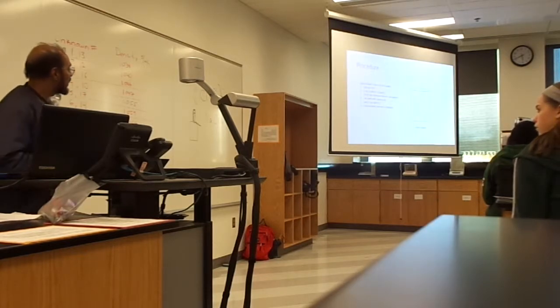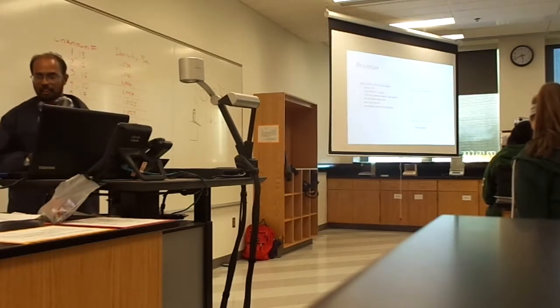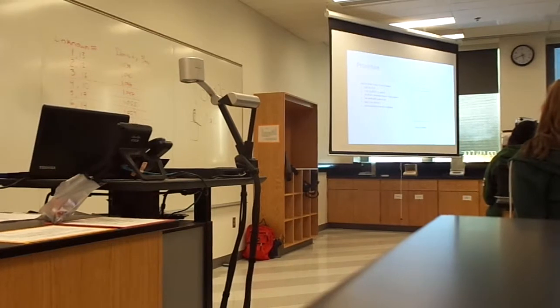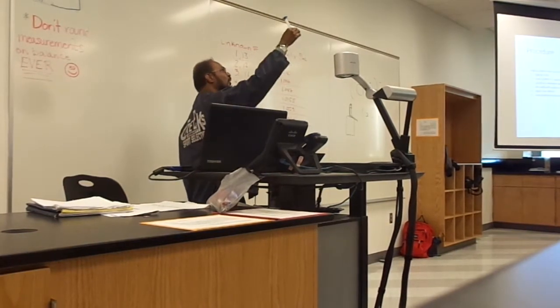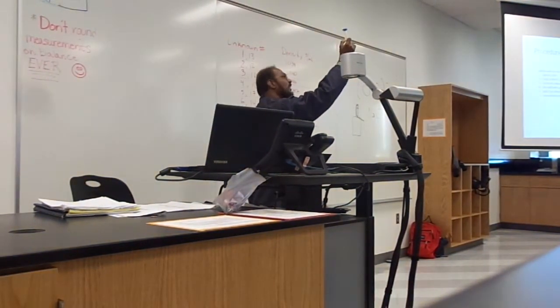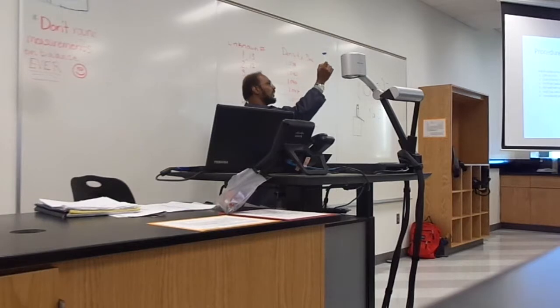And then in the procedure, remember, first thing you do is use a pipette and a volumetric flask, and this is a volumetric flask. You can see the calibration mark here, somewhere in the middle. That's the 50 milliliter mark. It's not the top.